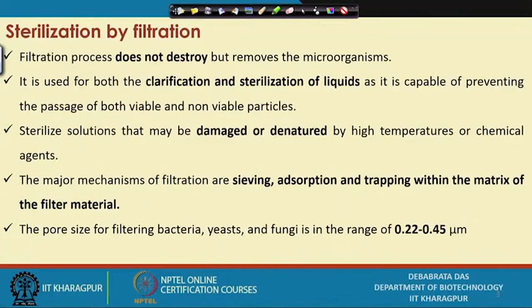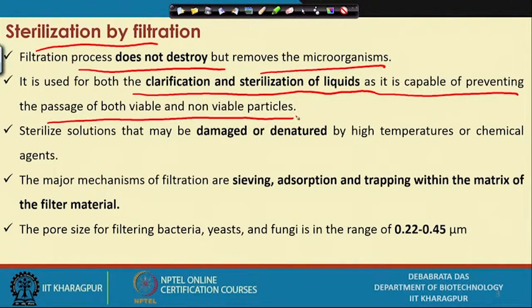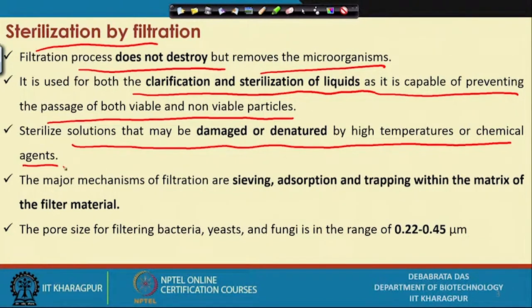Am I right? Now, let me discuss how the sterilization process is effective by filtration. The filtration process does not destroy, but removes the microorganism. It is used both for clarification and sterilization of liquid, as it is capable of preventing the passage of both viable and non-viable particles. A sterilized solution may be damaged or denatured by high temperature or chemical agent. This is one of the reasons we can consider sterilization by filtration in the case of the medium sterilization process.